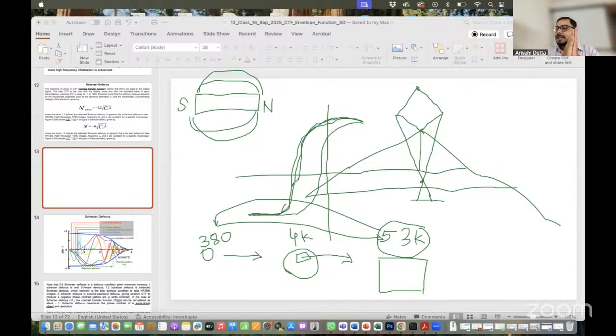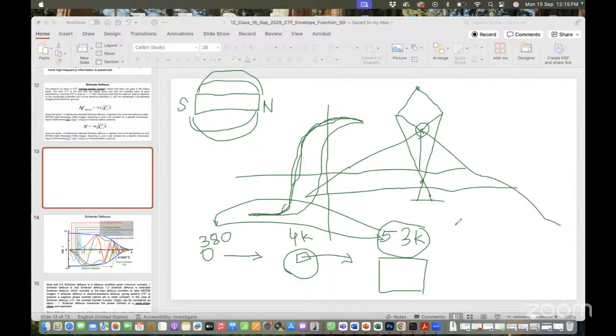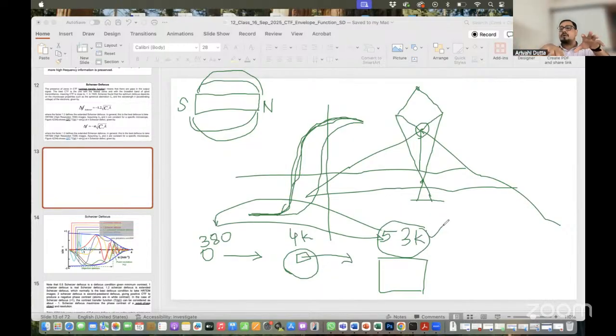Now when you are thinking that, okay, I am using a certain magnetic field or certain defocus value to image one thing very perfectly, but already, because of your bad handling, the magnetic field is not following the same path. The metal has already stored some magnetic portion. So whenever you apply a certain magnetic field for a particular magnification, it will add more, and then it will give you a wrong magnification, wrong defocus value. That is basically lens hysteresis, and it contributes to your image.